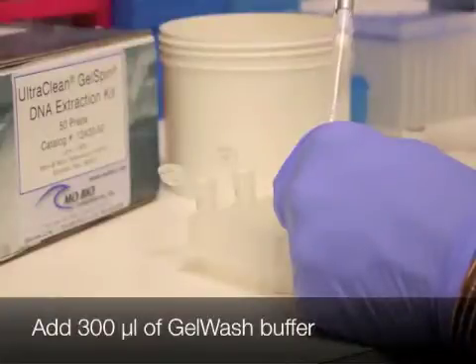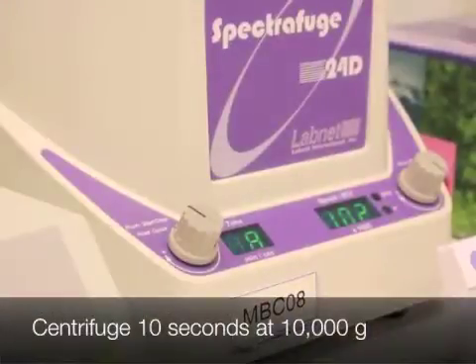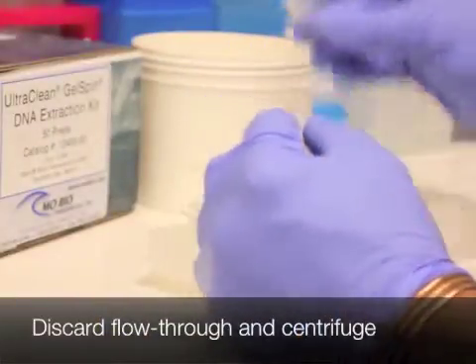Add 300 microliters of gel wash buffer. Centrifuge for 10 seconds. Discard the flow-through and centrifuge again for 30 seconds.